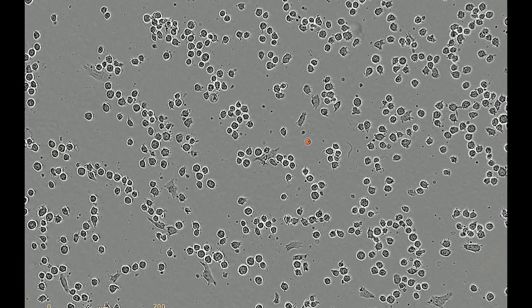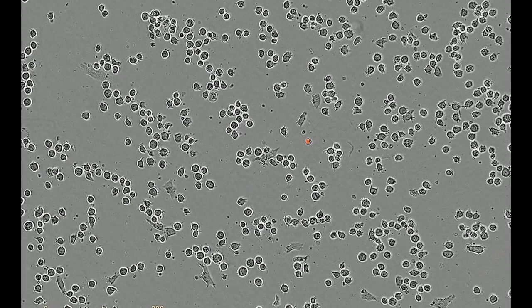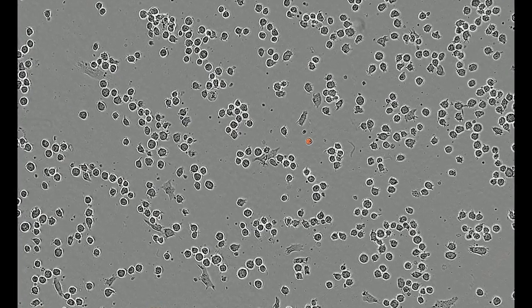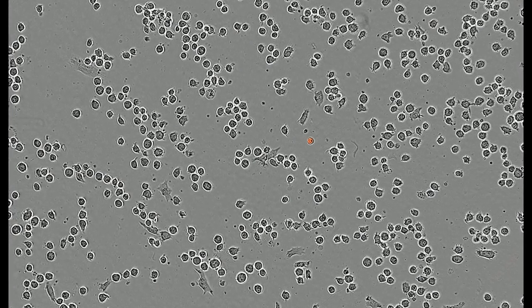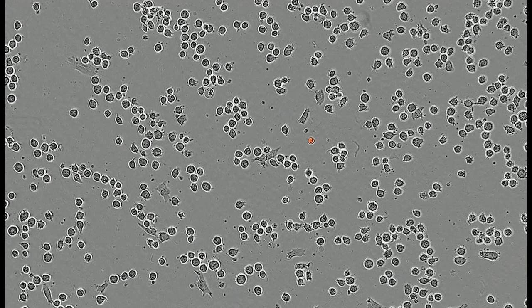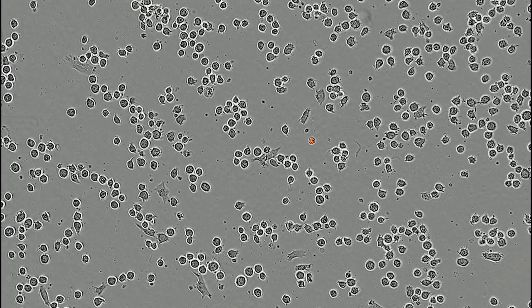Once the cells pick up the labeled protein in so-called phagosomes, these phagosomes start to acidify and develop into lysosomes. As a result of the acidification process, pH-rhodo becomes highly fluorescent which we can observe in the microscope by a red signal.